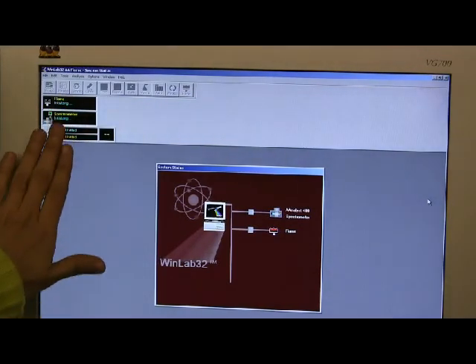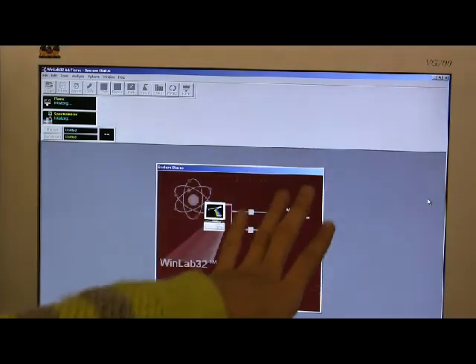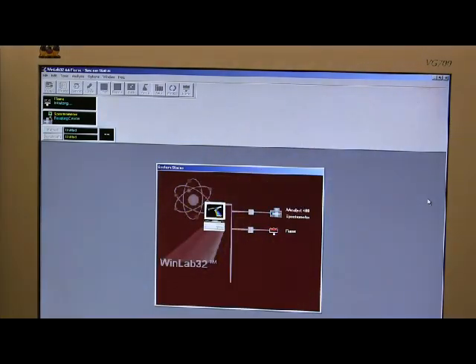This is initializing. If you see that it was not connected, just close it and start it again. And if that is repeated again and again, just restart the system. Switch this equipment off and then restart the computer.